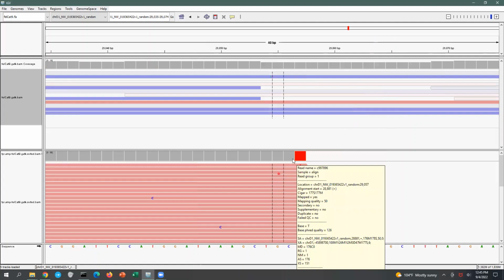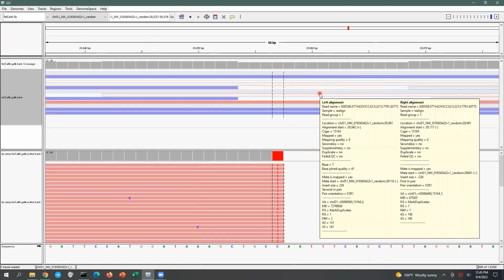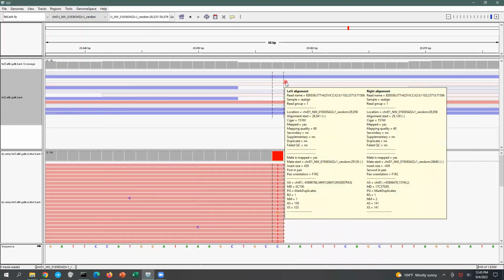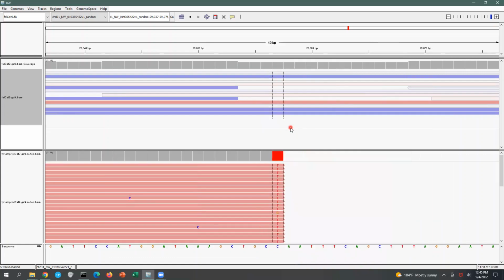I can explain at the end, because I think something happened in library preparation such that the end of the amplicon is not the biological sequence. And I could say that in terms of, here's the whole genome sequencing data. We can see there's no variants of any type. It's all the reference genome.